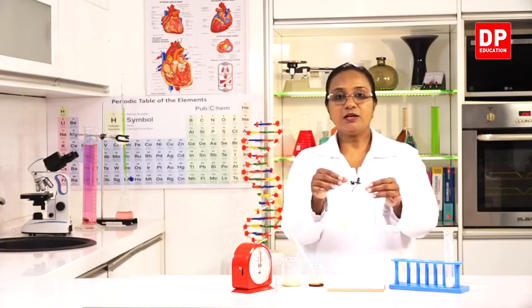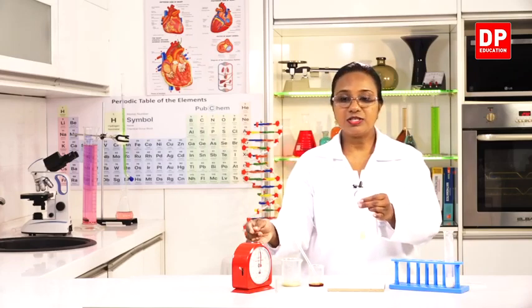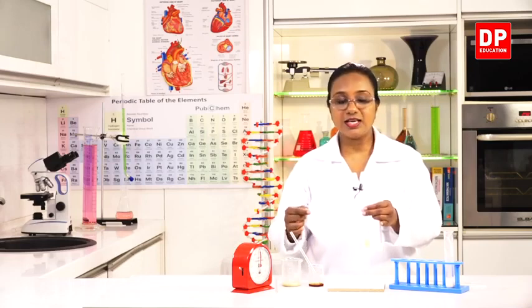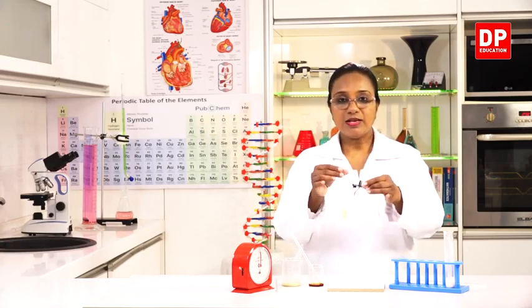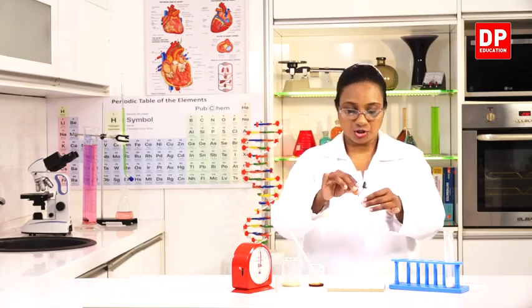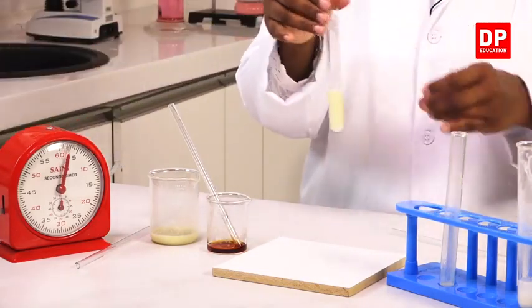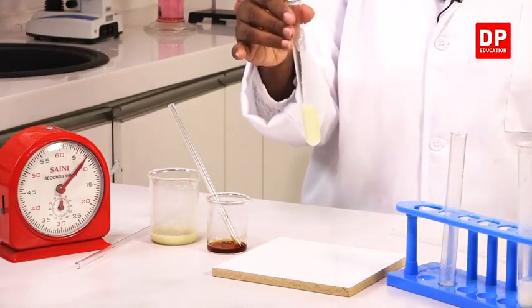If you all are doing it in a group, one person can mix it. Simultaneously, another student can start the stopwatch, because we will need to time this activity and do the testing every 2 minutes for 20 minutes. So, now I will mix the solutions and immediately start the stopwatch. So, now the reaction will take place between starch and amylase.